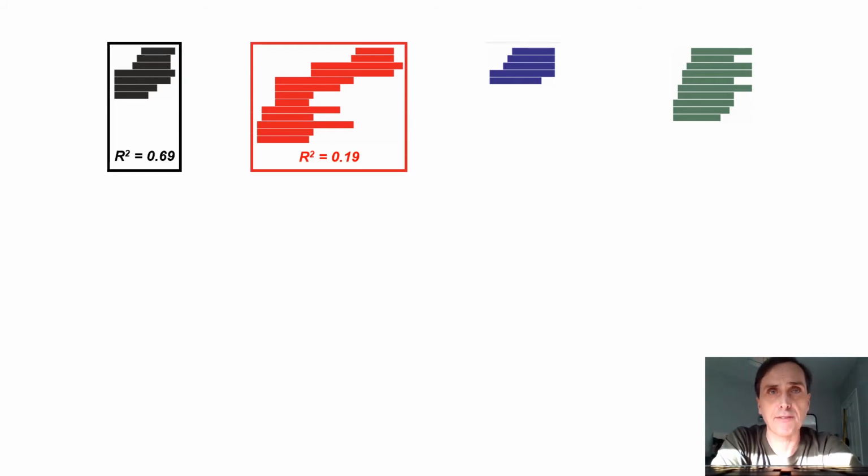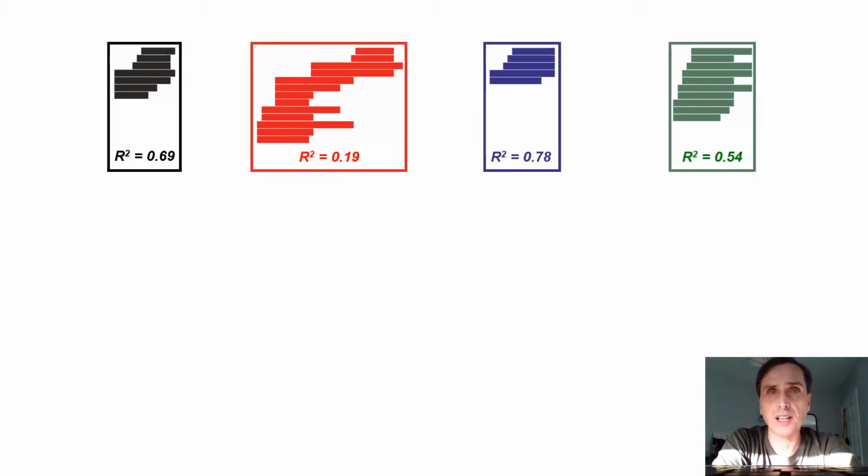When these are optimized independently, as expected, we get different optimization performance, as shown by the respective coefficients of determination here, which is the correspondence between the optimized LNP and the original reference LNP.